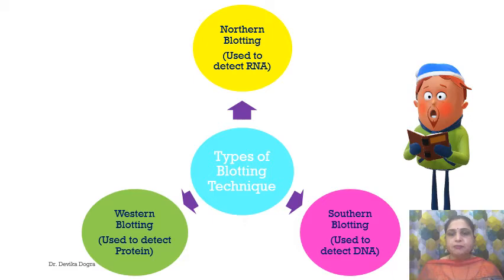Southern blot technique is based on the specific base pairing property of complementary nucleic acid strand. This technique is therefore based on DNA hybridization. Similarly, the northern blot is used to demonstrate the specific RNA. In this, the total RNA is isolated from the cell, electrophoresed, and then blotted onto a membrane. This is then probed with radioactive complementary DNA. There, RNA-DNA hybridization will occur, and this technique is used to detect the gene expression in a tissue.